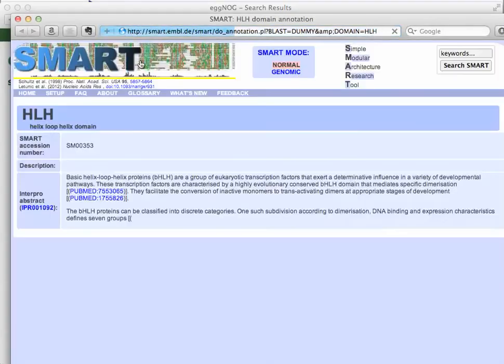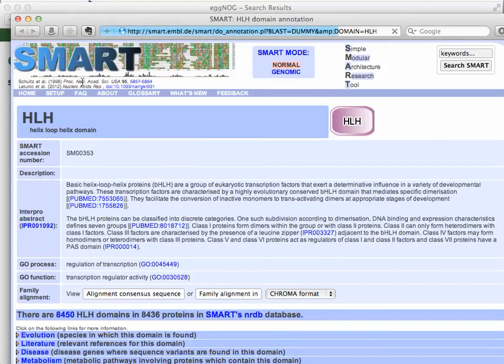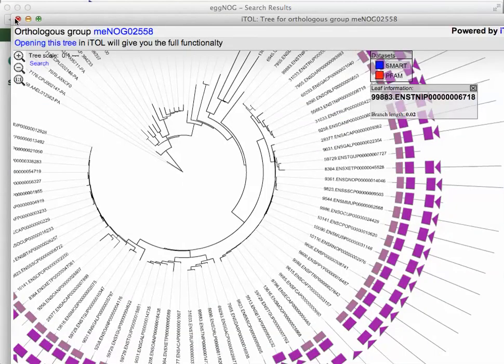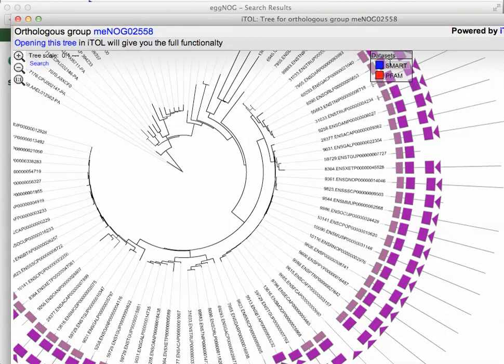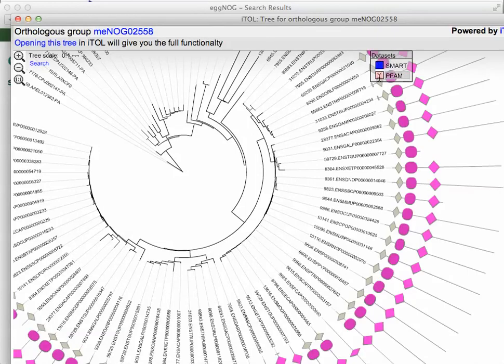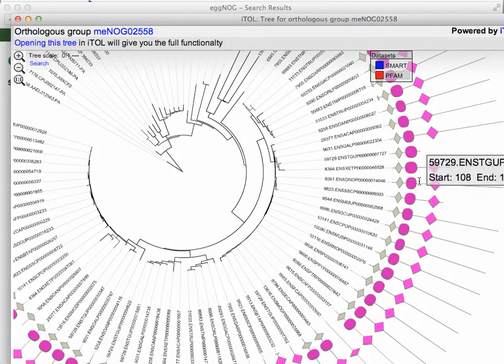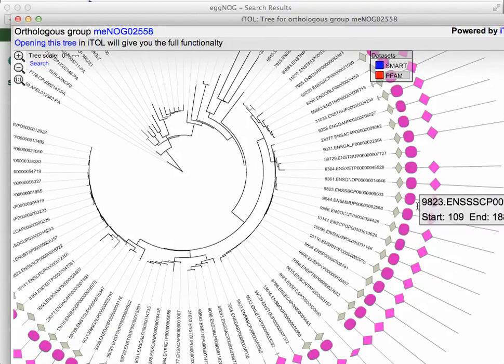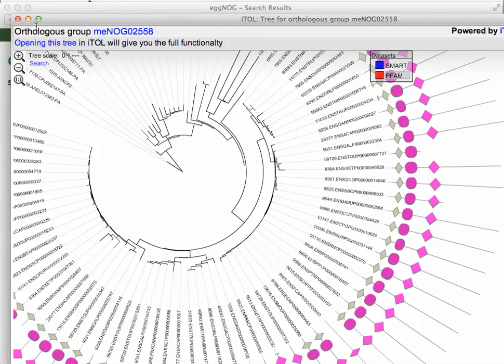I can click on that, and it will take me to SMART and give me information about this domain. For example, helix loop, helix domain, HLH. If I didn't want SMART, I could do PFAM instead. There we go. And get an idea of the structure and evolution of this group.